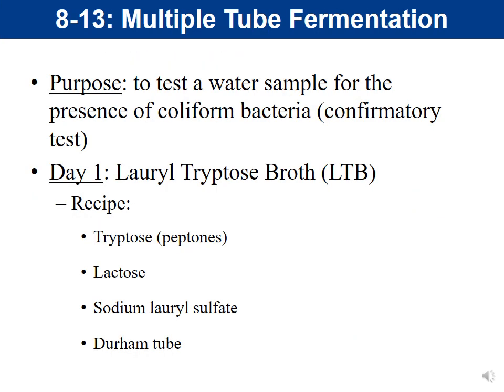So now we need to talk about our multiple tube fermentation. Again, the purpose of this multiple tube fermentation is to test a water sample for the presence of coliform bacteria. And again, this is our confirmatory test.